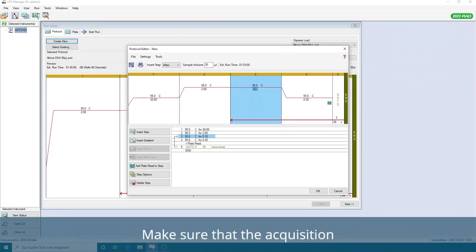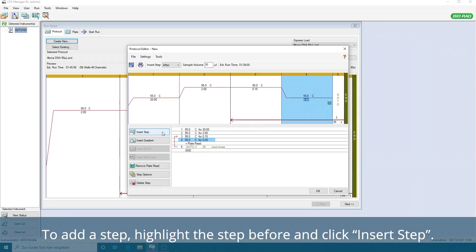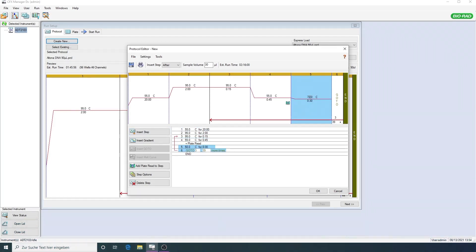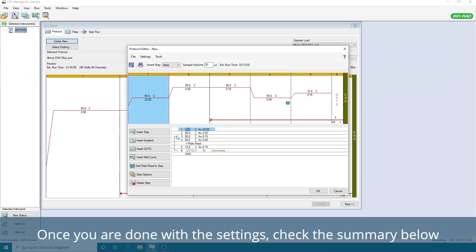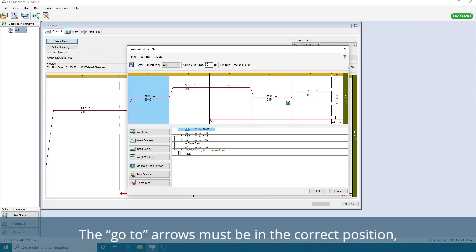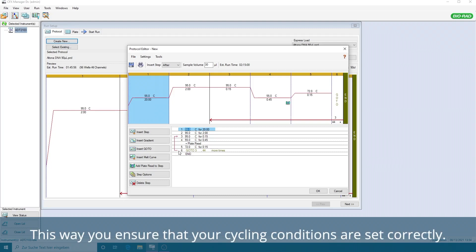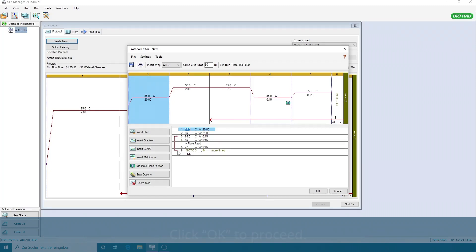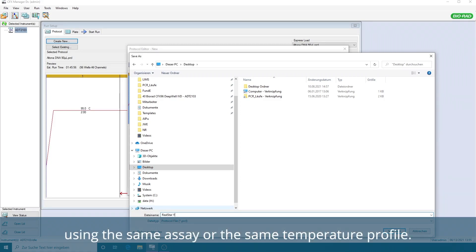Make sure that the acquisition, indicated with the camera symbol, is set to the correct cycling step. To add a step, highlight the step before and click Insert Step. Change the number of cycles to 45 by adding 44 cycles. Once you are done with the settings, check the summary below to see if all settings are correct. The Go To arrows must be in the correct position, going from the 72 degrees Celsius step back to 95 degrees Celsius for 15 seconds. This way, you ensure that your cycling conditions are set correctly. Click OK to proceed. A new window opens where you can save the protocol as a template for future runs, using the same assay or the same temperature profile.